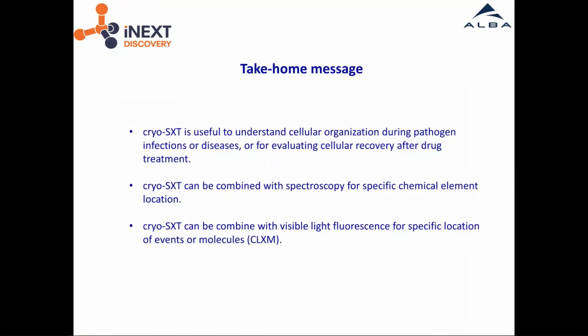So finally, my take-home message is that cryo soft X-ray tomography can be useful to understand cellular organization during pathogen infections or diseases, or even when you have an infection, to evaluate the cellular recovery once you have used a certain type of specific drug treatment.